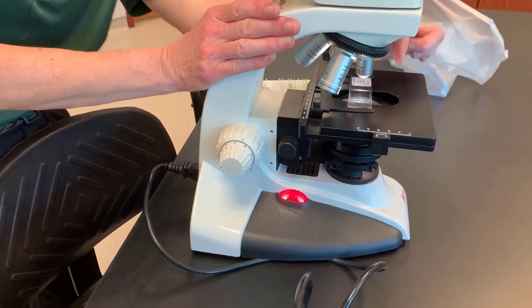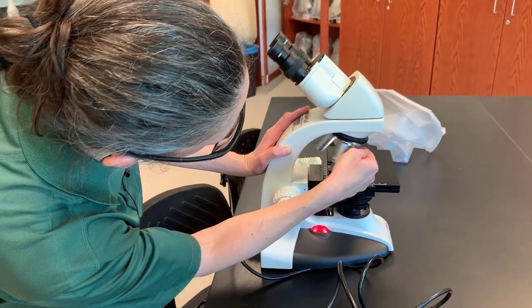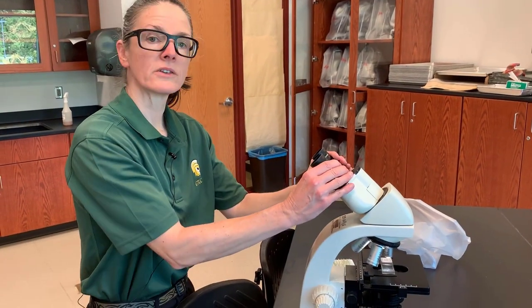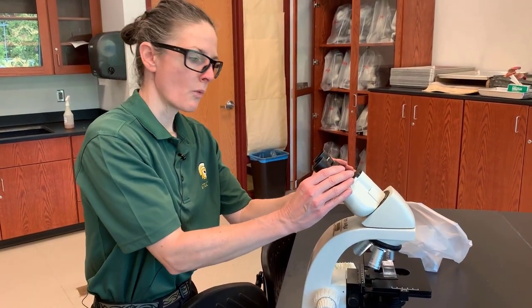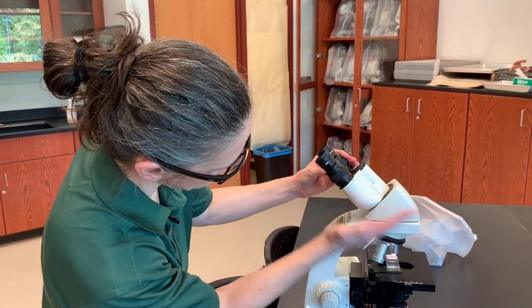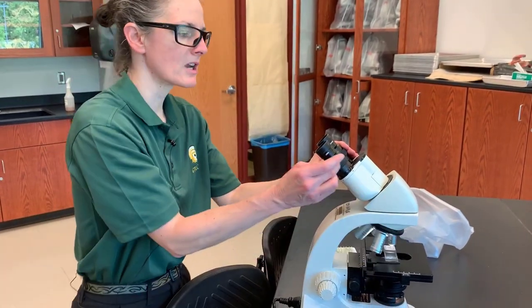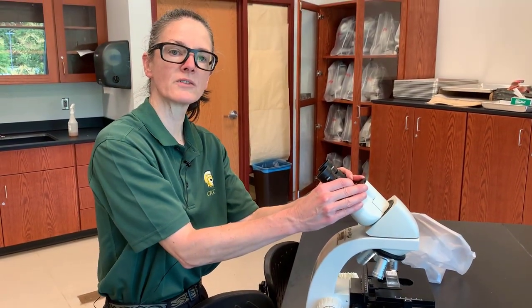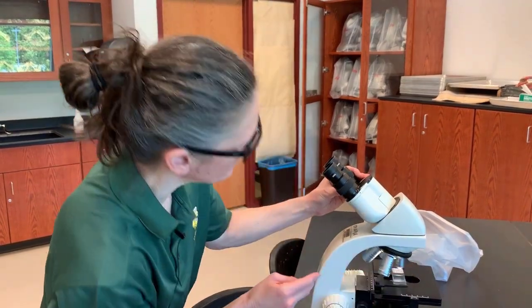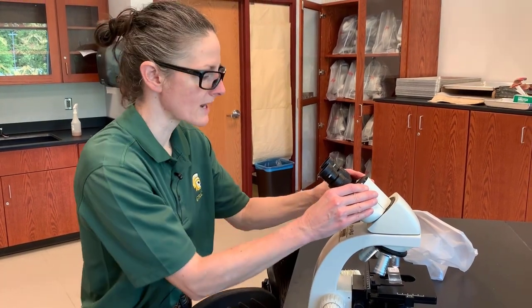When we start, we always start with our scanning objective. The scanning objective will magnify what's on the slide four times. Our ocular lenses will magnify the subject ten times. So to get the total magnification, we multiply the objective lens magnification times the ocular lens magnification. The ocular lenses here are 10x and our scanning objective is 4x, so you multiply 4 times 10 to get 40x — a 40 times magnification.